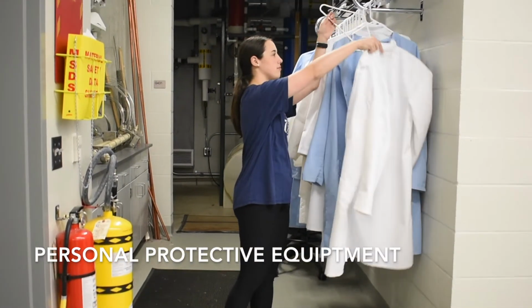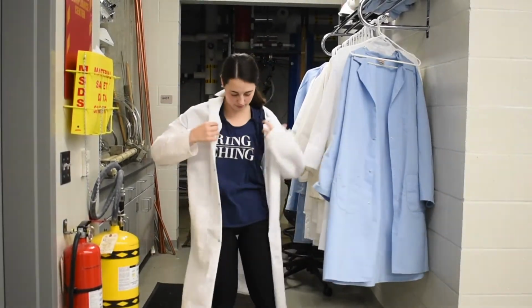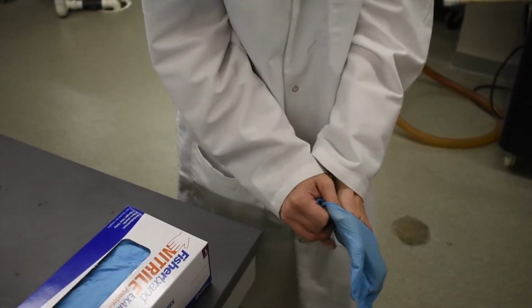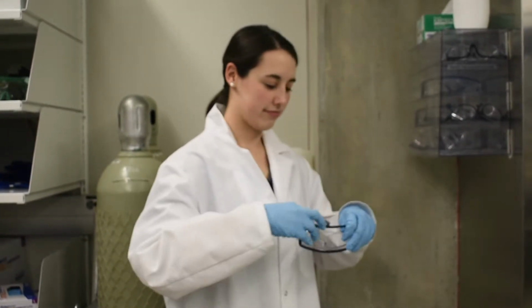For this lab, proper PPE should be worn and includes long pants, closed-toed shoes, a lab coat, nitrile gloves, and safety glasses.